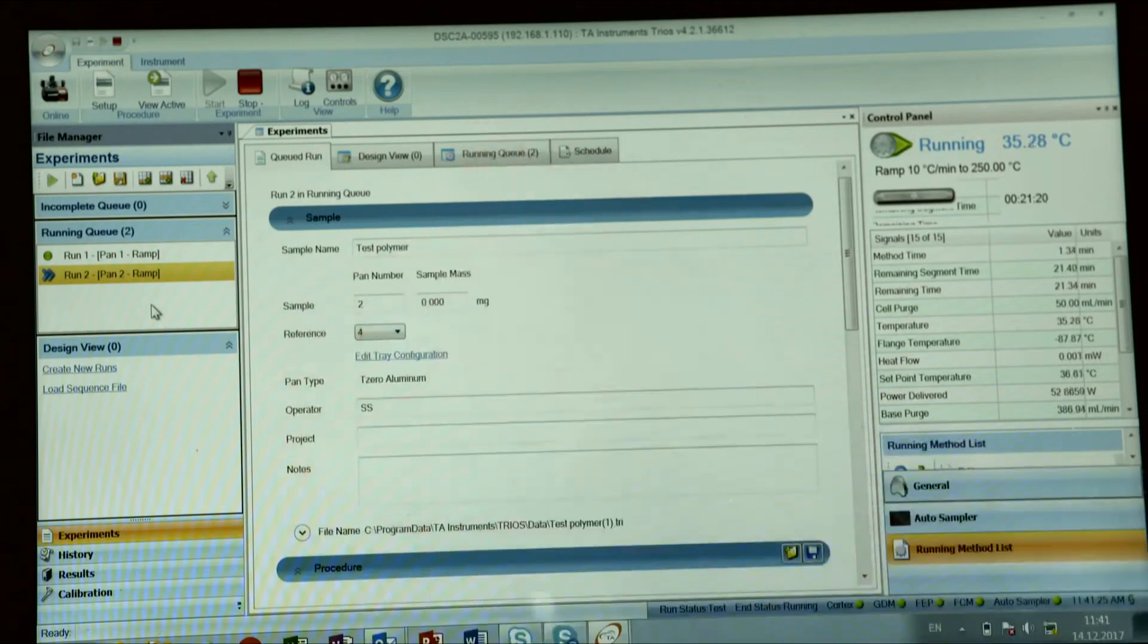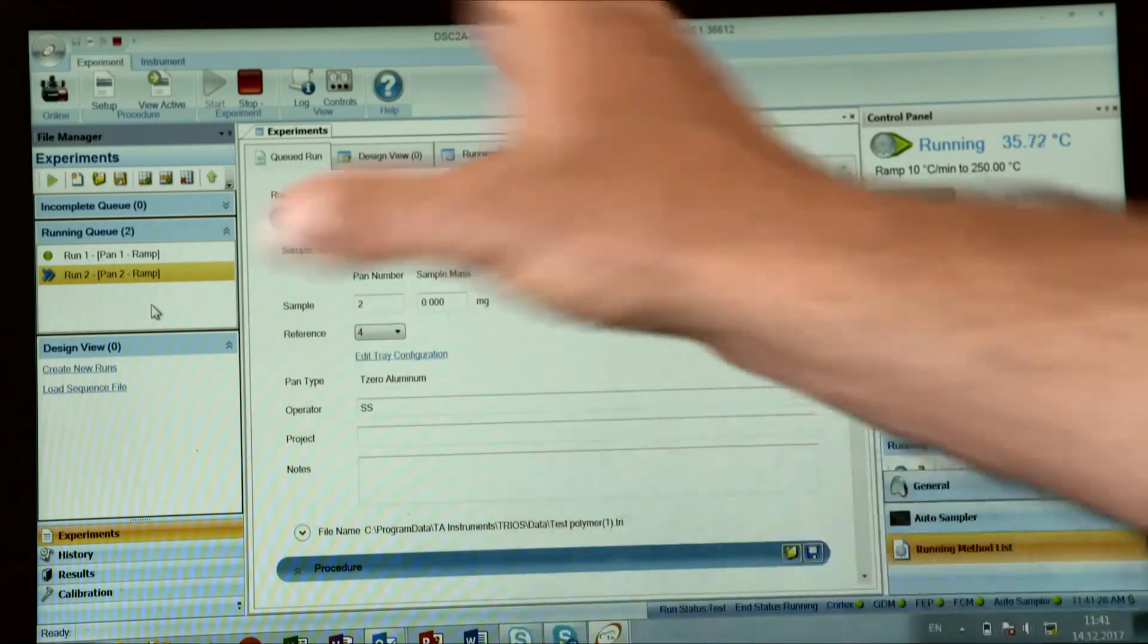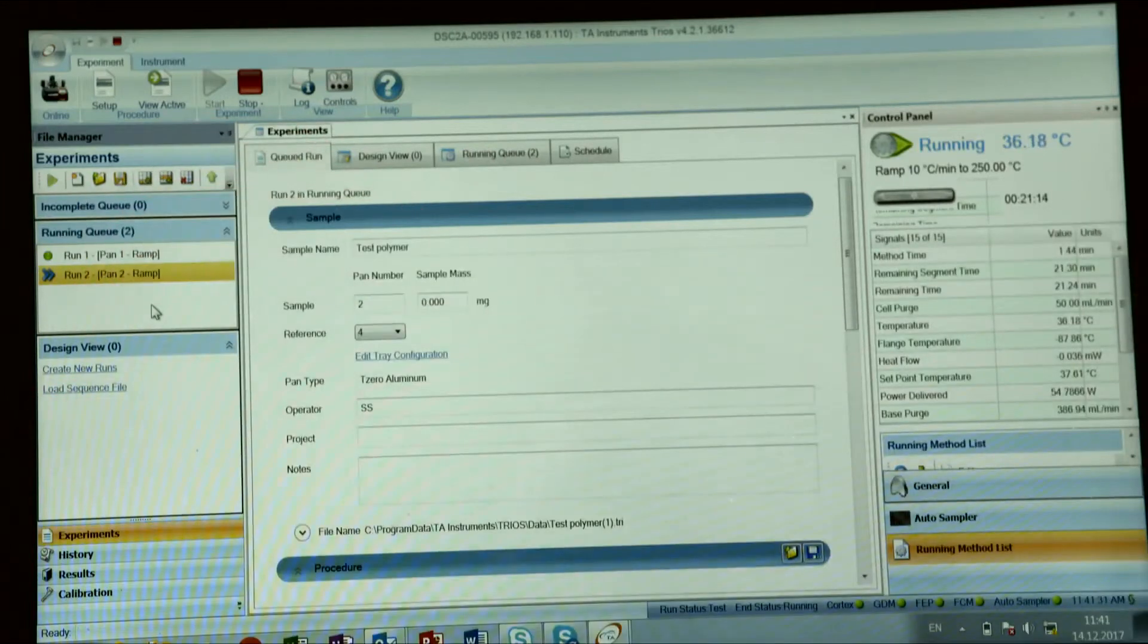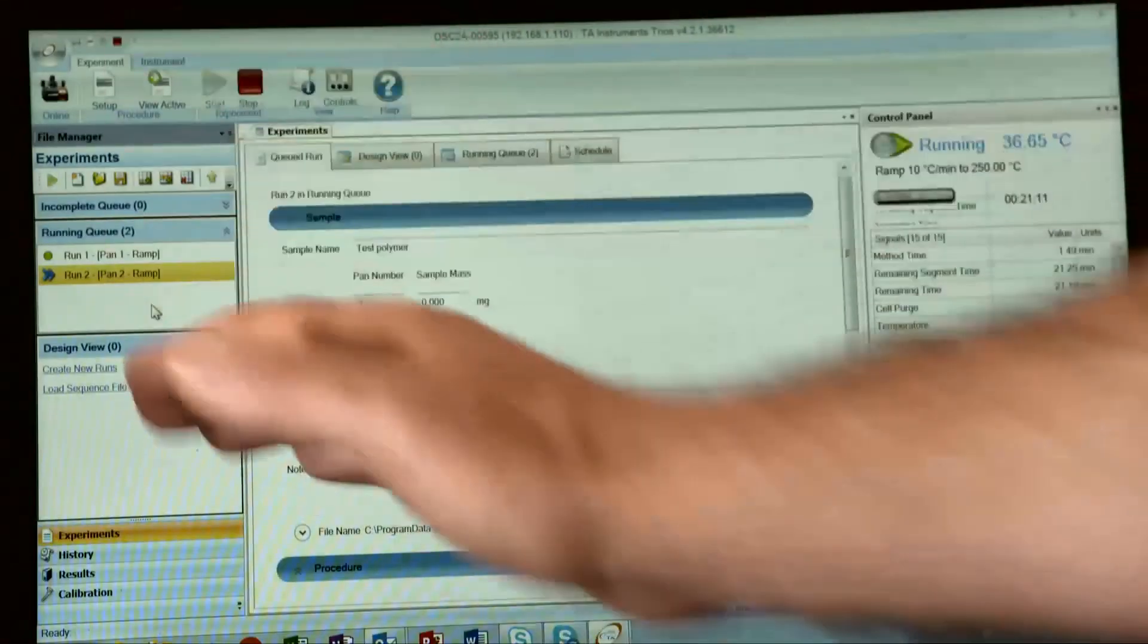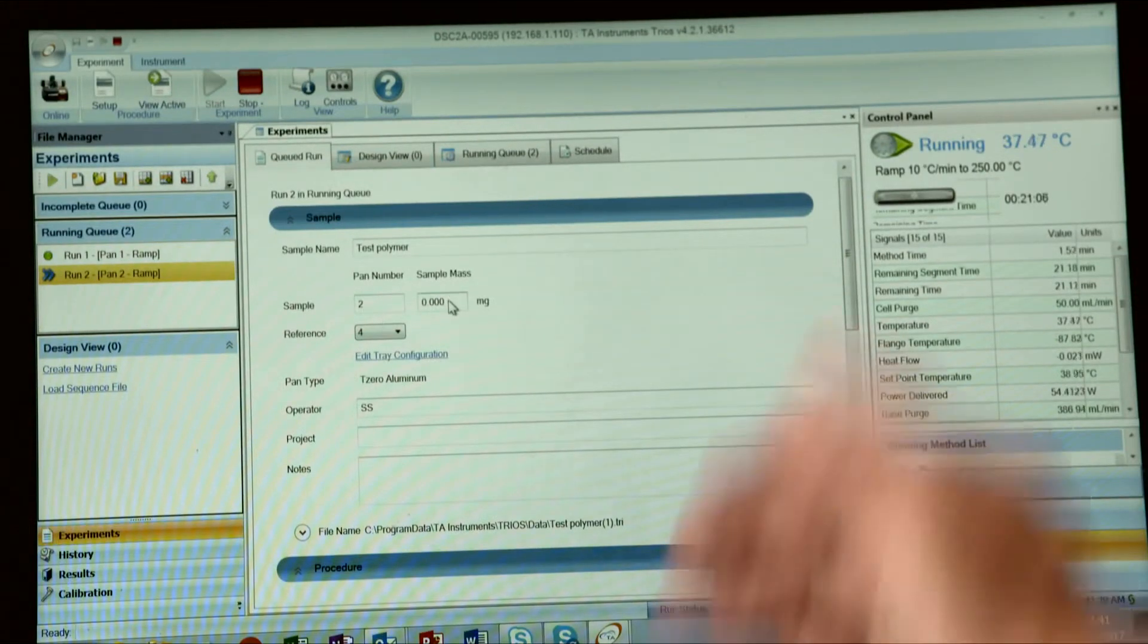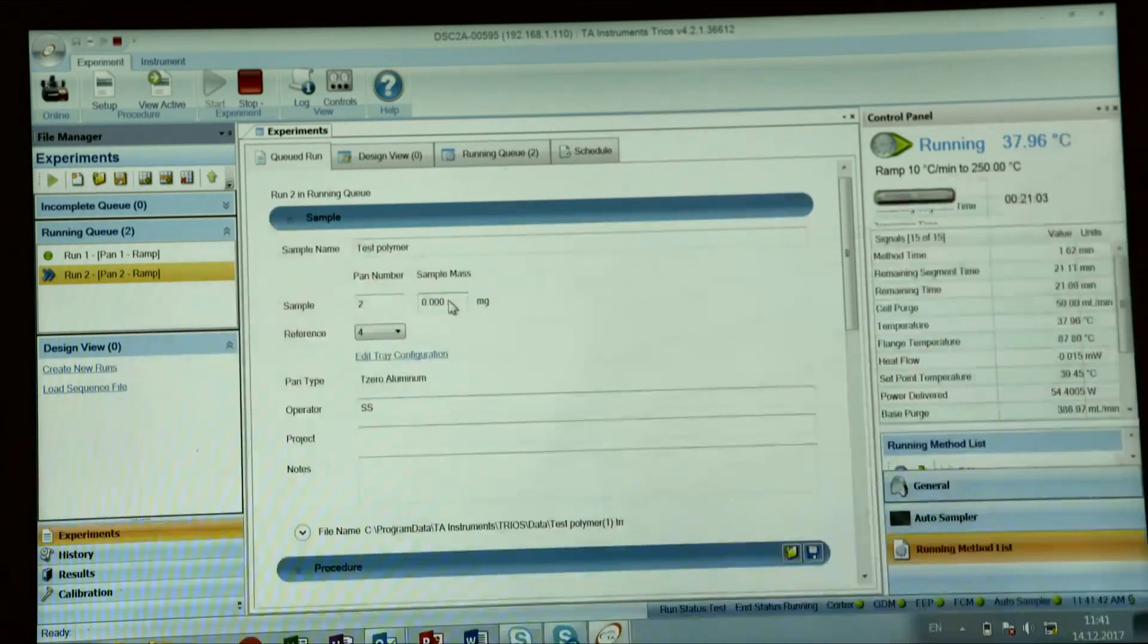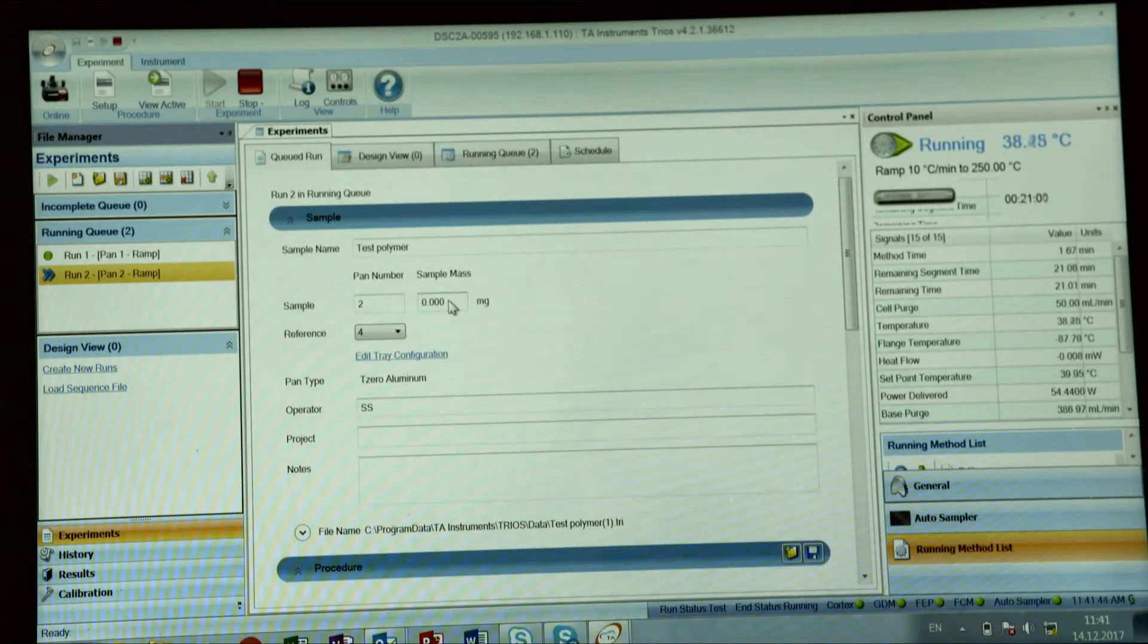And you can add as many runs as you want, either during creating a sequence or while one test is running. You can keep adding by changing sample position or reference position, type of the test and so on. Each run does not really depend on previous or on next run.